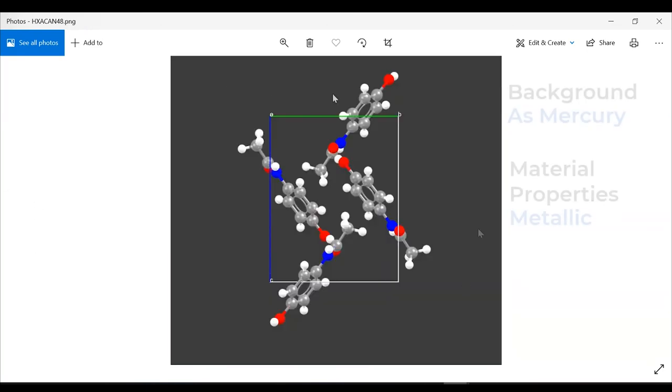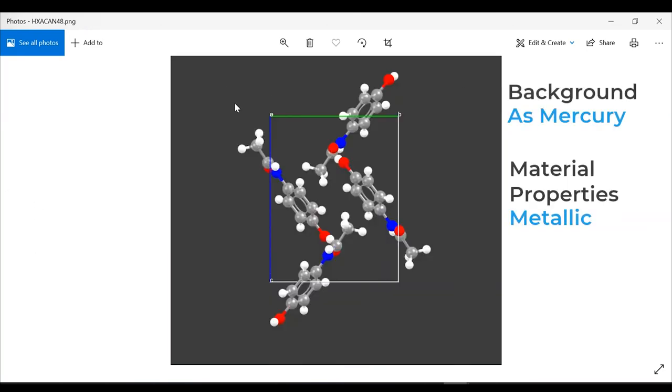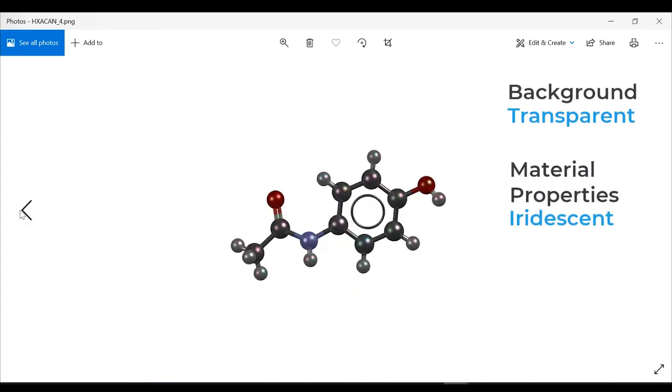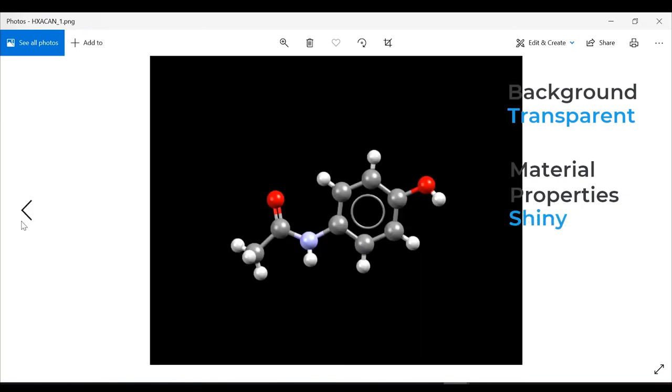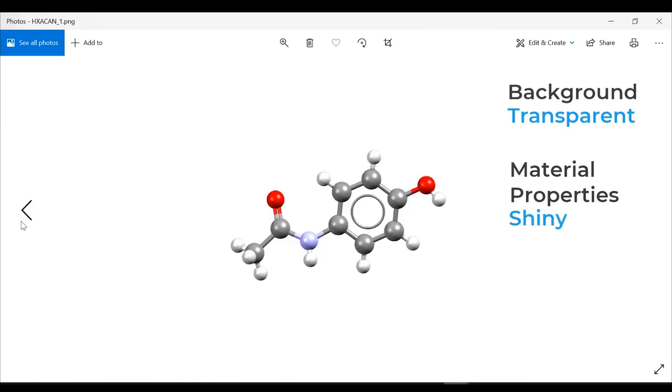This is what it would have looked like if we kept it as Mercury. We can still see the shininess of the metallic style. These are just other styles just to show you how the iridescent looks like. This is metallic, you can see the reflections. This is matte, shiny, and this is as Mercury.